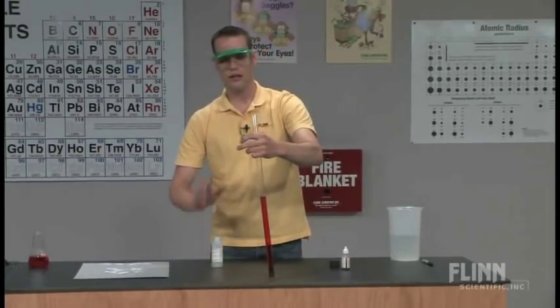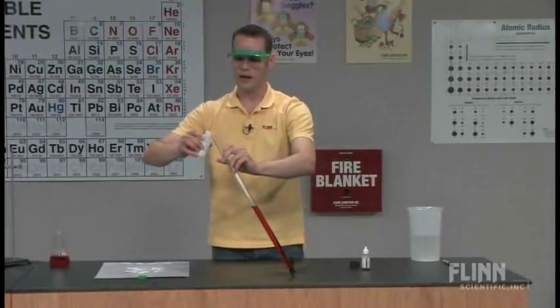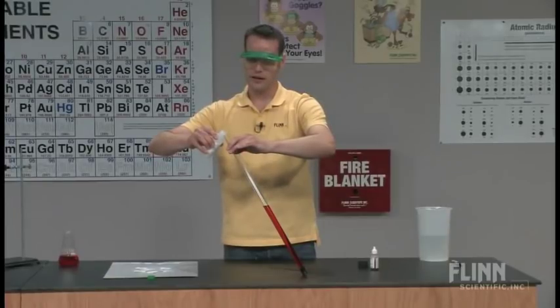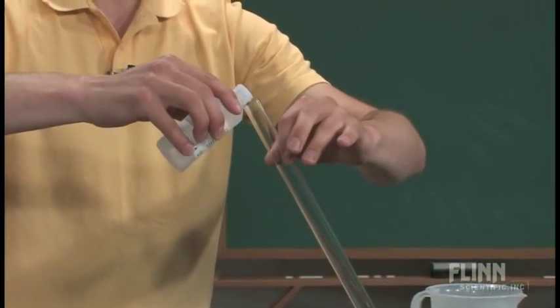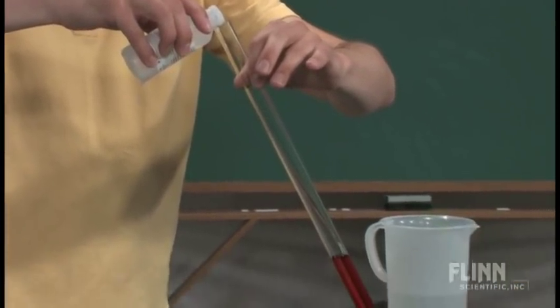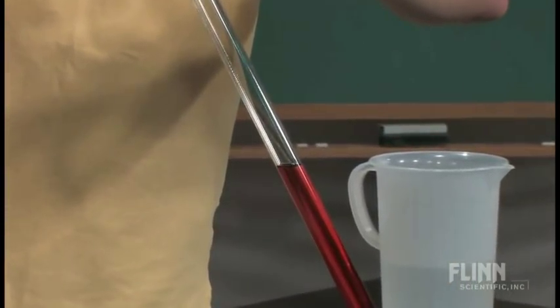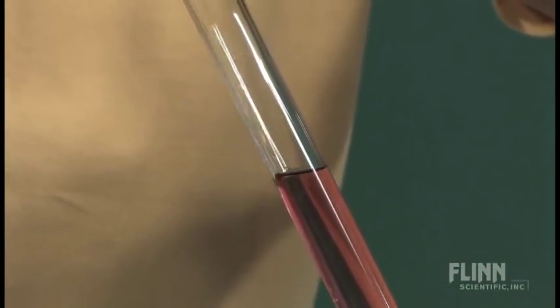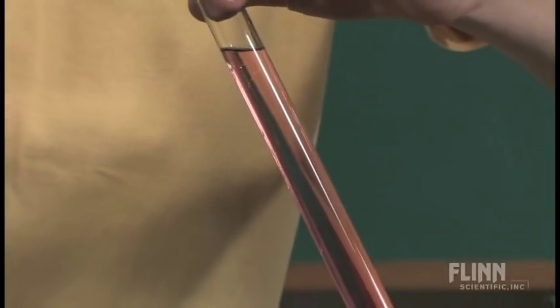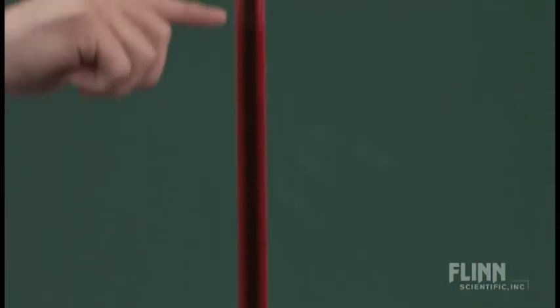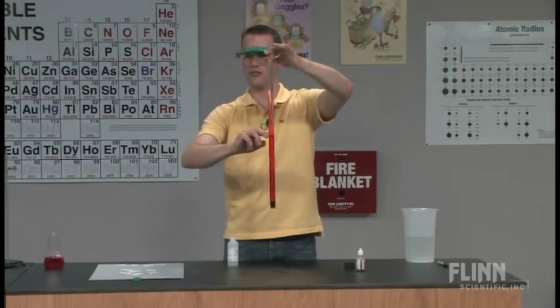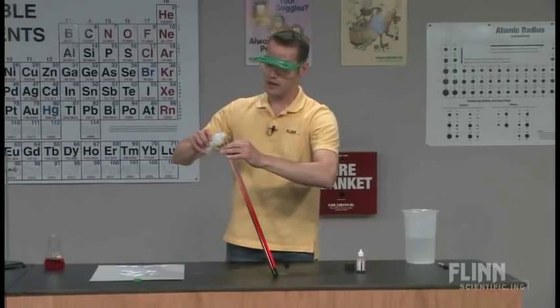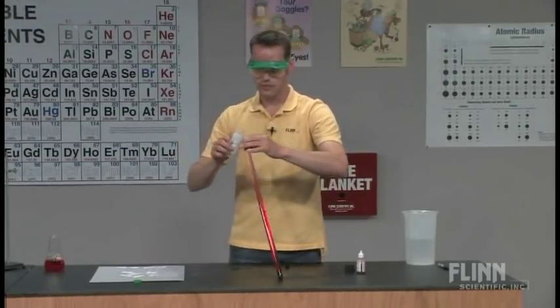And then you'll very carefully take the methanol. Methanol isn't required for this. You can do this with ethanol. The important thing is that the alcohol is very dry, very anhydrous in order for this to work. If it's a 95% or a 70%, it will work. But the drier you can get the alcohol, the better this demonstration is. So then I just layer the methanol on top. And I pour this very carefully down the side, because I do want to show the students the difference in density. Because at this point in the year, we've just talked about density. The students can still see a fairly clear gradation. And you can talk about the fact that methanol is less dense than water, and so it's going to layer on top. But the two will mix together, both of them have an OH group.